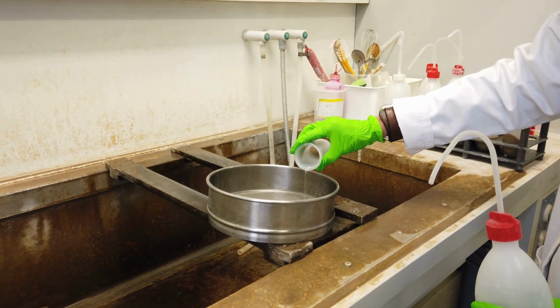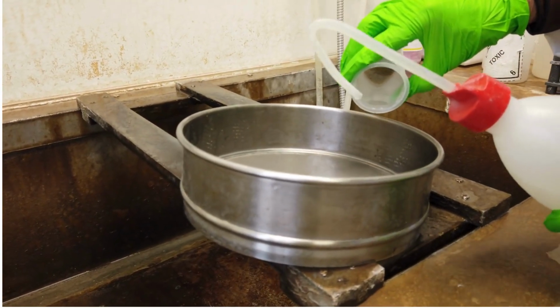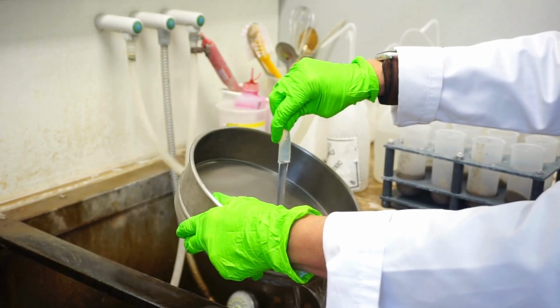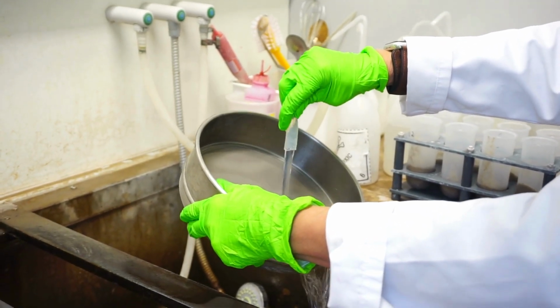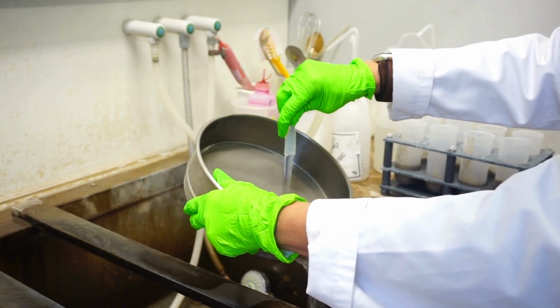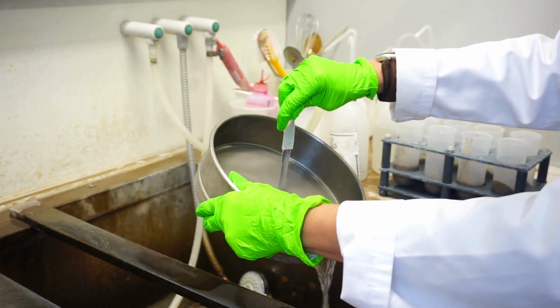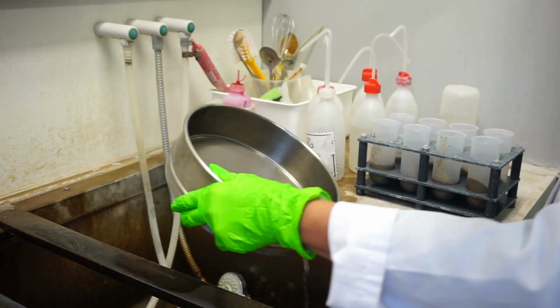After centrifugation, the supernatant is poured over the 38 micrometer sieve, avoiding the transport of sediment. The material is washed one more time to remove Ludox and placed in a small recipient. This step is important as the final sample will be preserved in formaldehyde, and any trace of leftover Ludox would react to the chemical and crystallize, making the identification process particularly challenging.